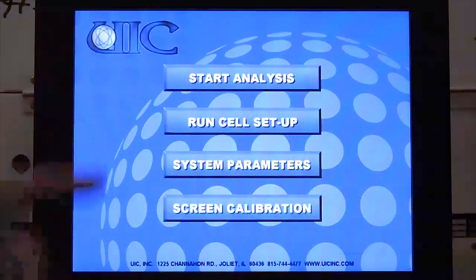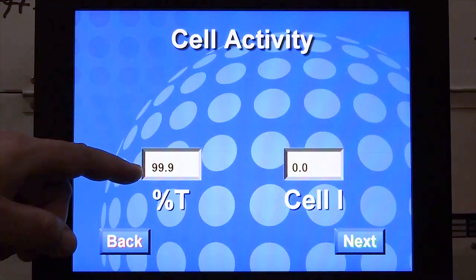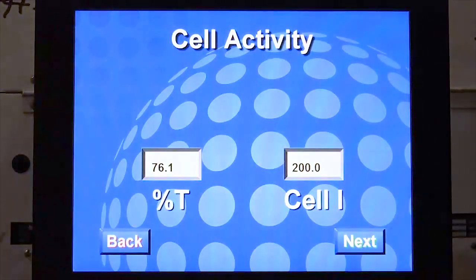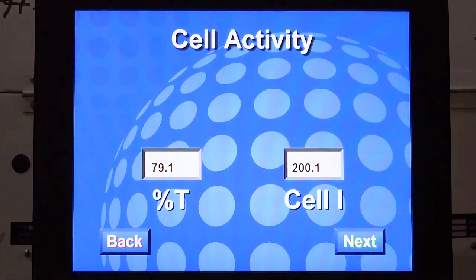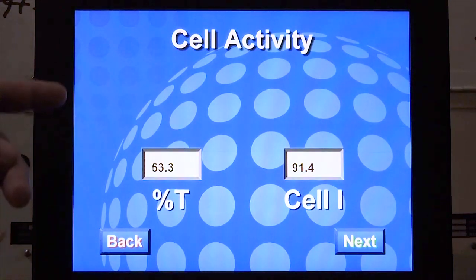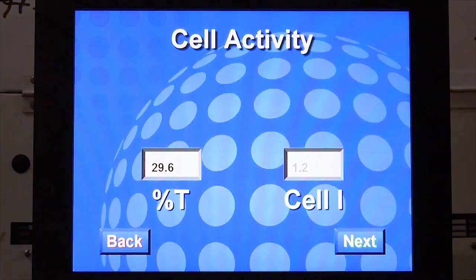Titrating the cell. Press Start Analysis. In this step, we'll titrate the cell down. The cell should be at 100% transparency and the cell current should be zero. Flip the cell current switch to the on position. The cell current should change to 200 milliamps and the transparency should begin decreasing. The cathode solution will slowly change color and become bluer. The percent T number should decrease to 29.5% plus or minus 0.1; when it does, the titration is complete. While waiting, we recommend leaving the coulometer 45 minutes to an hour, even though 29.5 will be reached relatively quickly. After waiting, the cathode compartment's contents should be blue, percent T should be 29.5, and the system is stable and ready. After that, press next.